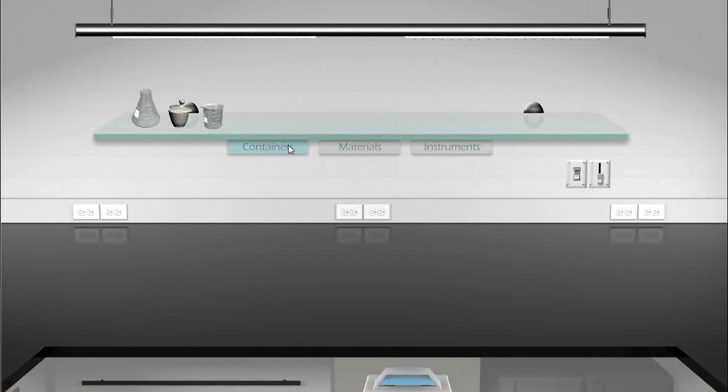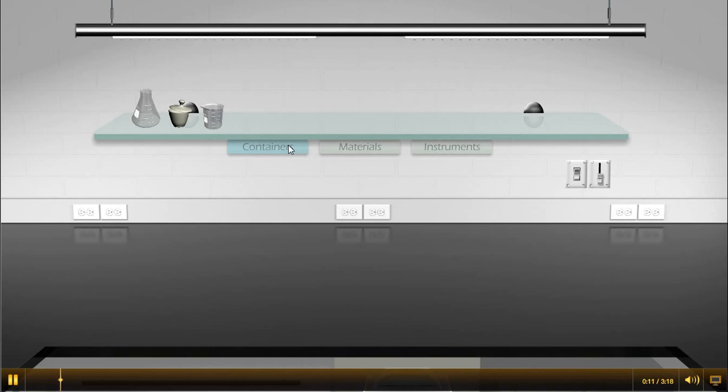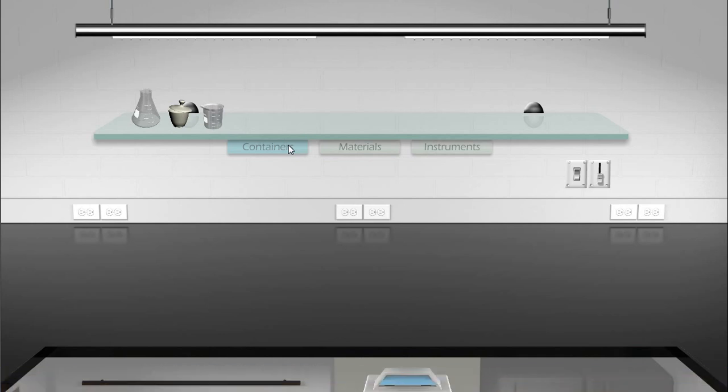This is Nick and Dennis, and today we will be performing a double displacement reaction involving two solutions, sodium hydroxide and nickel 2 chloride. A double displacement reaction is classified as a reaction where two compounds are mixed, and the negative and positive ions of these compounds are exchanged with one another in order to form two new compounds. This type of reaction can only occur with two aqueous solutions.